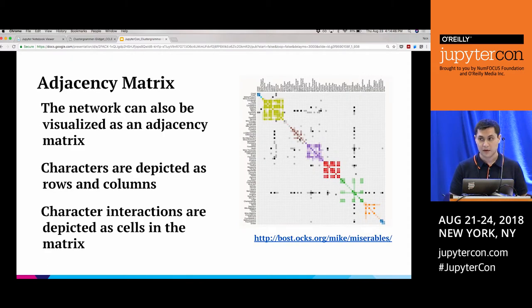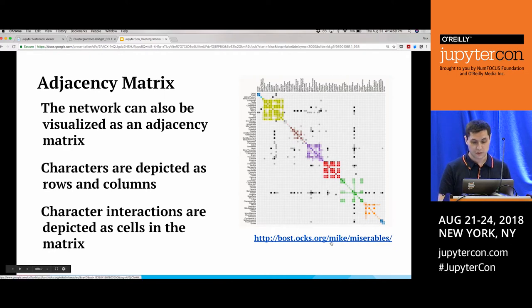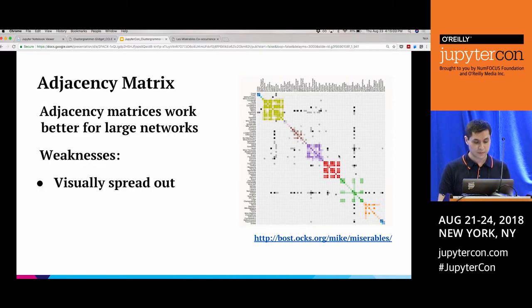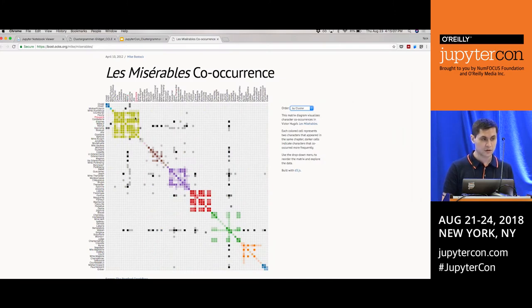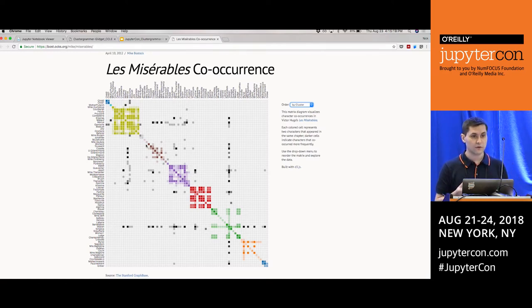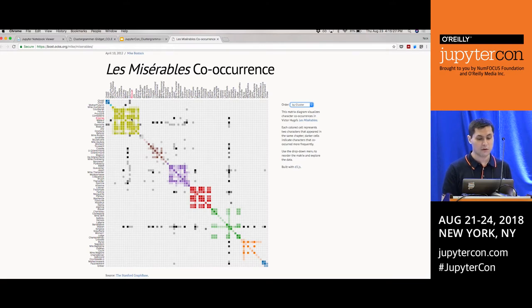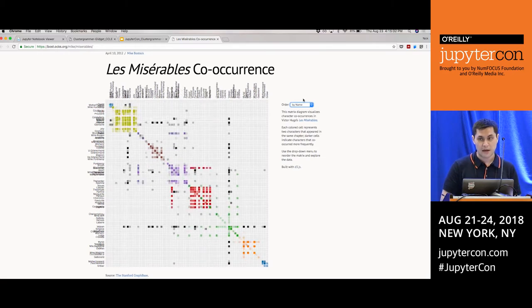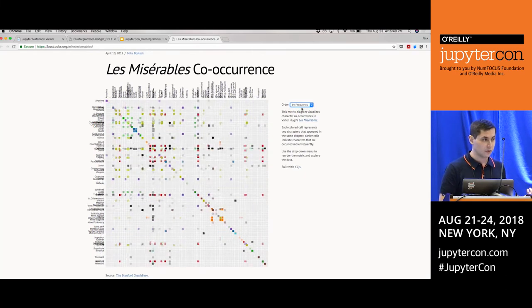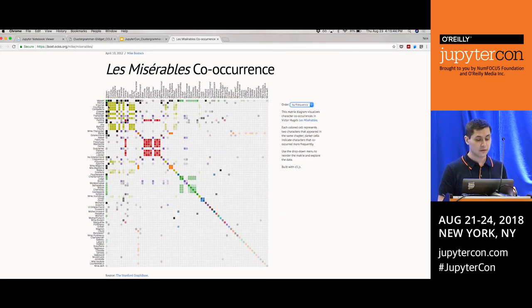An alternative way to visualize a network is using an adjacency matrix. With an adjacency matrix, characters are both columns and rows, and the cells indicate their interaction. You can also see clusters here. The orientation of the data helps visualize structure — characters can be ordered by hierarchical clustering to reveal groups, by name (which loses structure), or by frequency of total interactions to surface main characters.